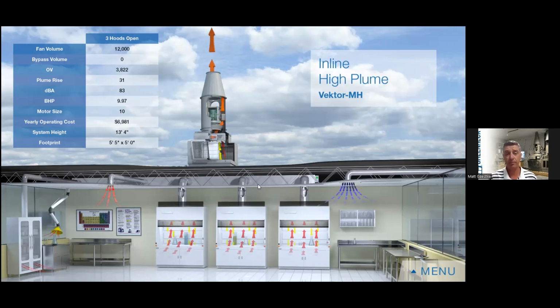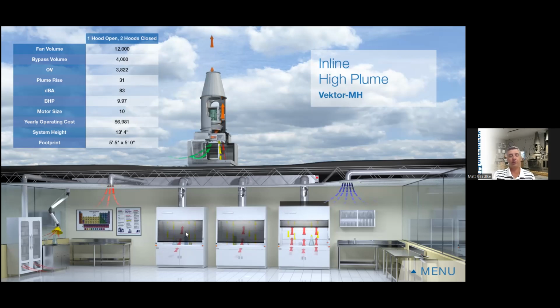So right now at 100% open in my chemical fume hoods, my fan is balanced, it's pulling the air, it's creating the plume, everything's where it needs to be. But as I close a sash, that valve closes, I go red for a second because my fan is on top of the facility trying to pull air from this lab, but there's less air available since these valves are closing when the sash is closed.